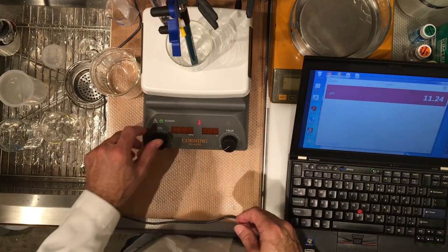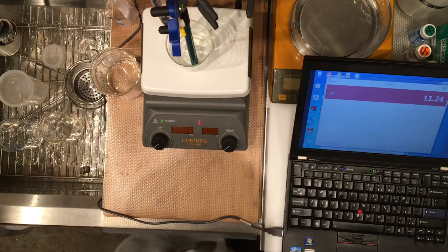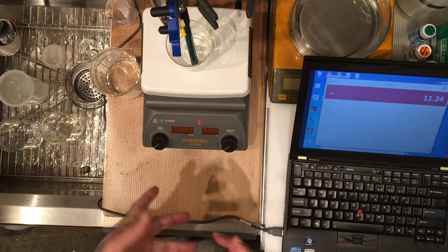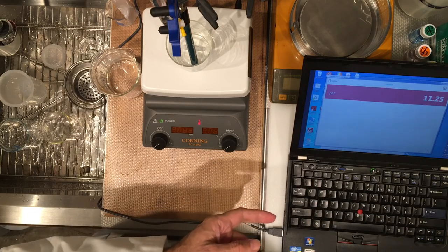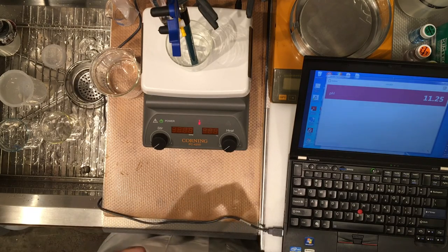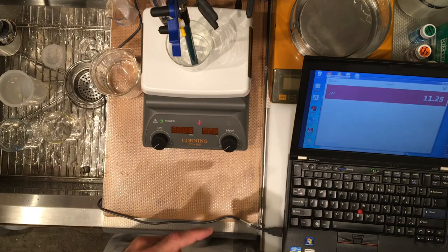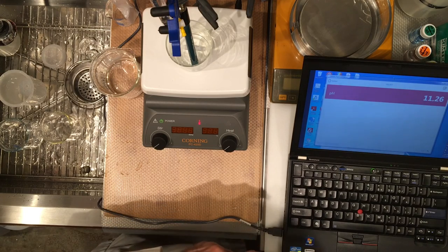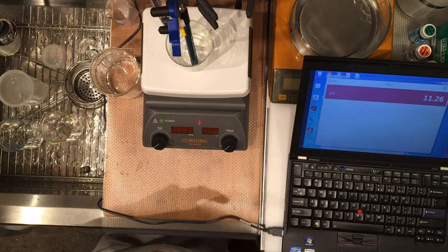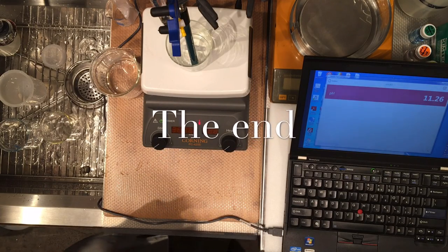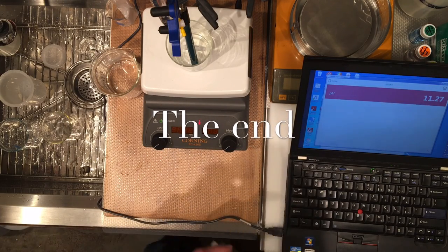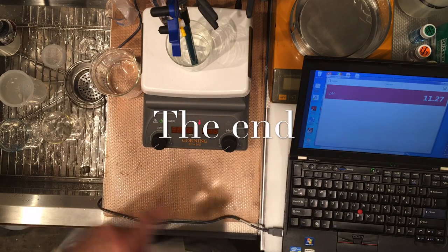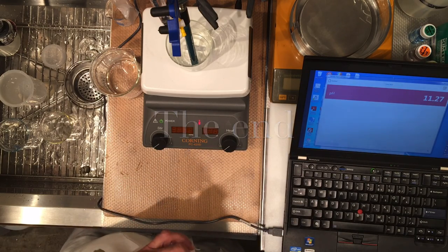Okay we are done with this work so now there you have it you have the masses you have the initial pHs from the initial pHs you can calculate the Ka1 first acid ionization constant Ka1 for this unknown acid and from the titration graph and the equivalence point you can calculate the molar mass.